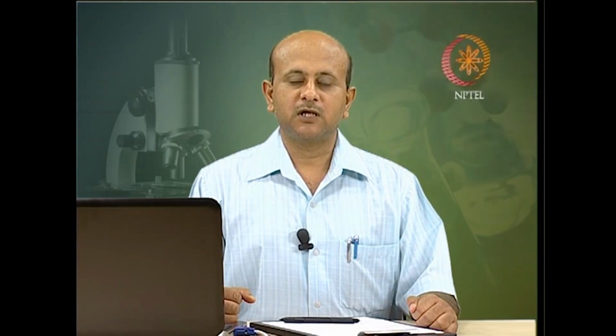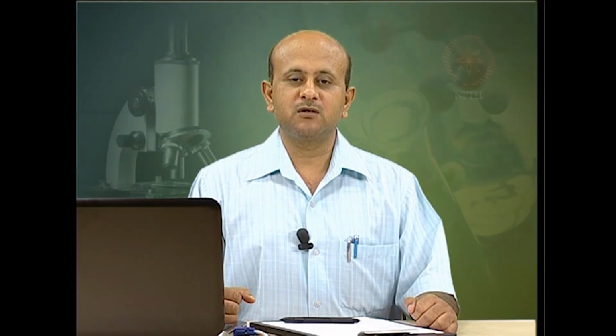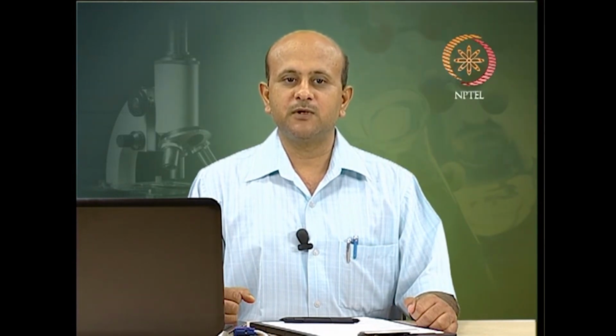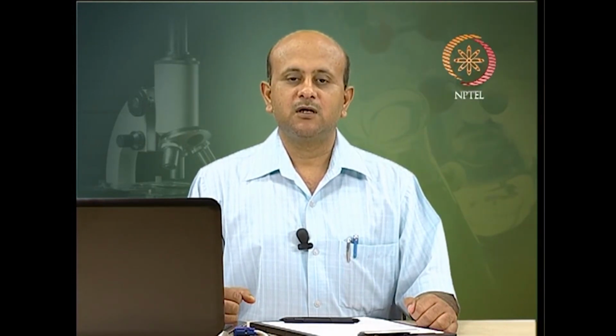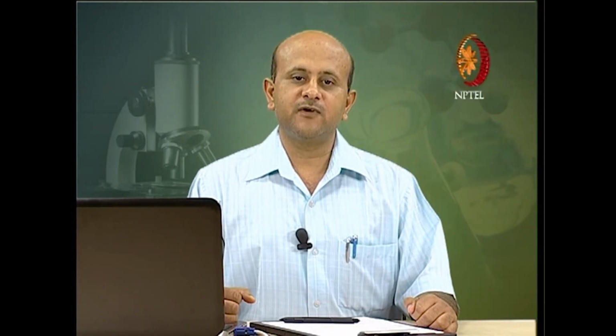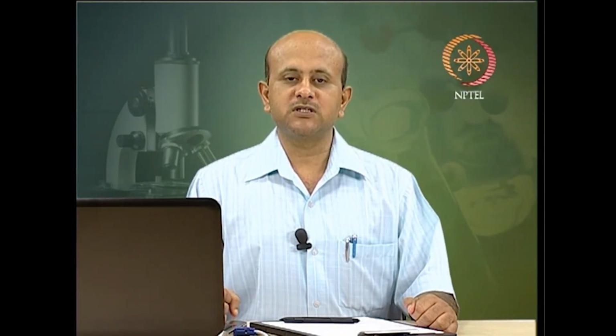Alright, now ultracentrifuges can be of two types, like we were discussing. One is the preparative ultracentrifuge and another is the analytical ultracentrifuge. So, let us start with the preparative ultracentrifuge. In a preparative ultracentrifuge, maximum rotor speed could go up to around 80,000 revolutions per minute, maybe more, and it can go even much higher in bench top ultracentrifuges, like 150,000 revolutions per minute, generating an RCF value of say 600,000 g. This is for floor models.